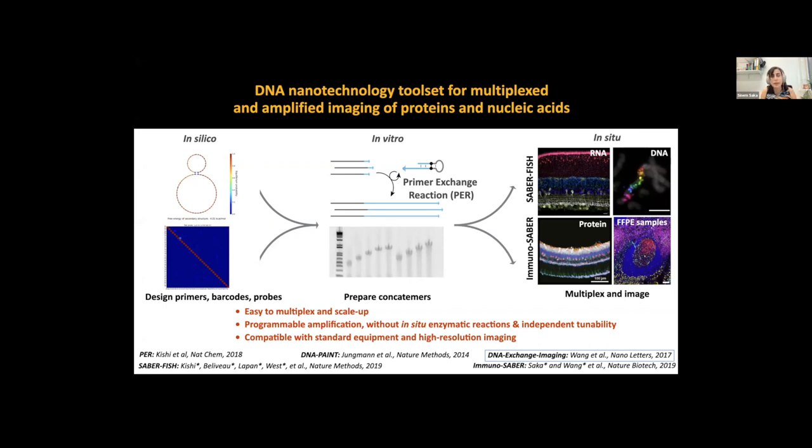If it comes up in discussion, we can also look at it, but it seems that at least in our measurements, for diffraction-limited imaging, the linear and one round of branching is not creating very big artifacts in terms of the resolution, and we are still staying in a diffraction-limited regime, mainly because we are using linear concatemers rather than very big DNA nanoballs that are potentially several microns long.